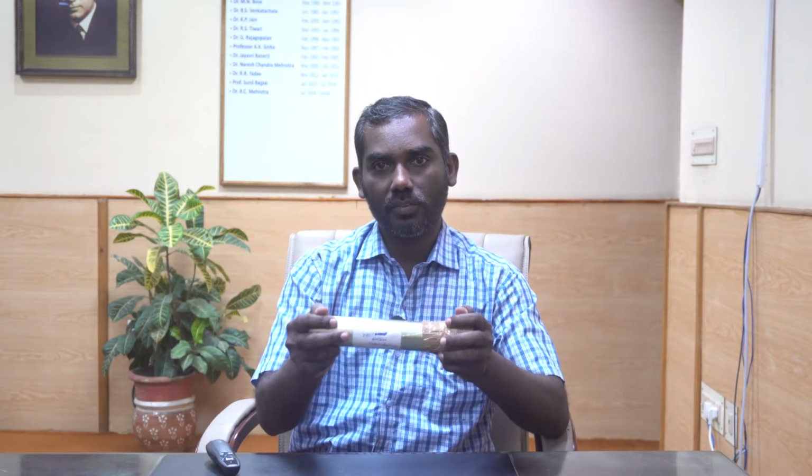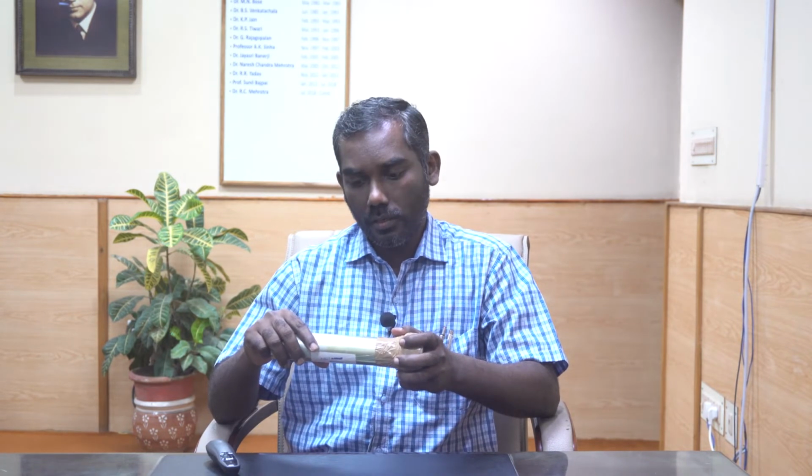So in that sense, once we collect the sample, it is unexposed to sunlight, and then we bring it to the lab, we open the pipe, we retrieve the sample that is unexposed to the sunlight, and then we open it in the lab under subdued light, so that there is no exposure to light, and then we prepare the samples. So this is the way we collect the samples and prepare them in the laboratory.